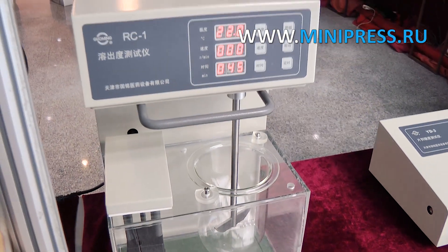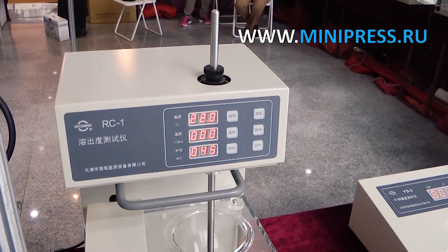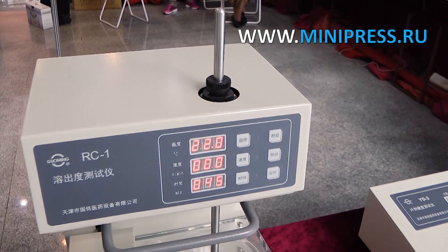The dissolution analyzer is used to measure the dissolution rate and degree of dissolution of tablets, capsules, etc. in the laboratory.